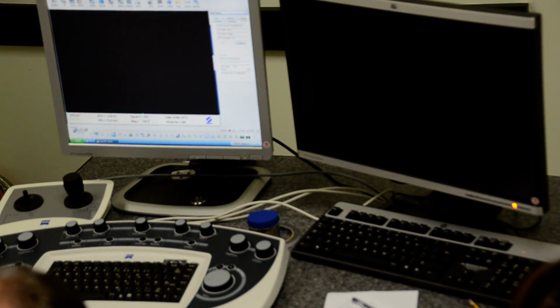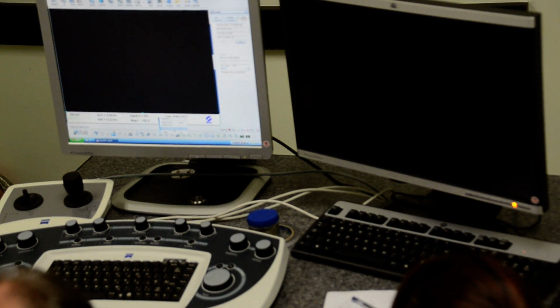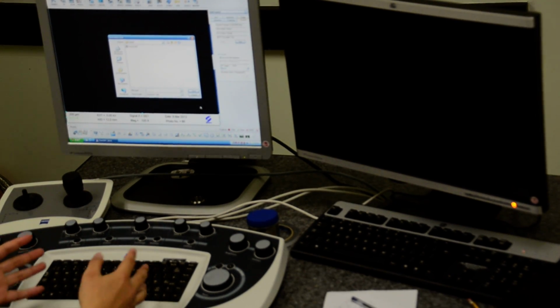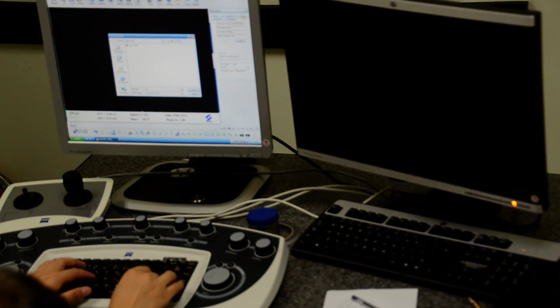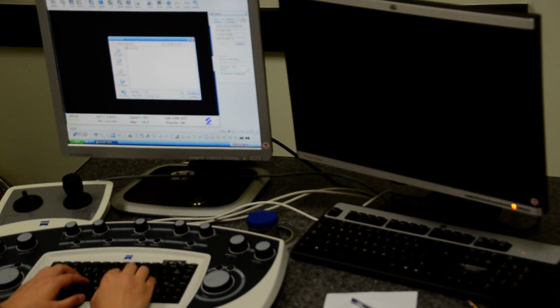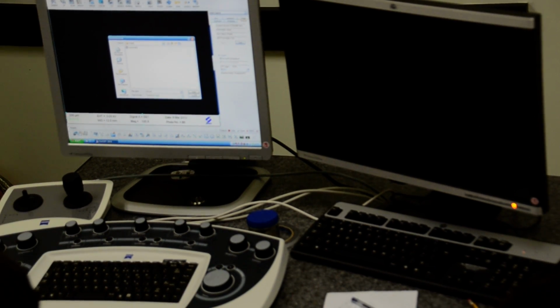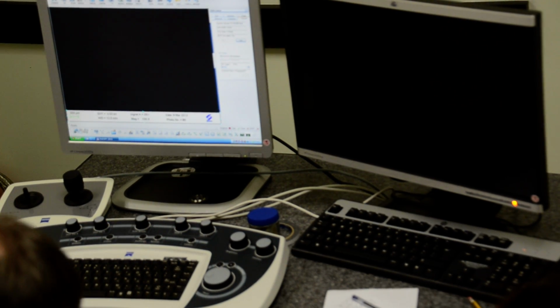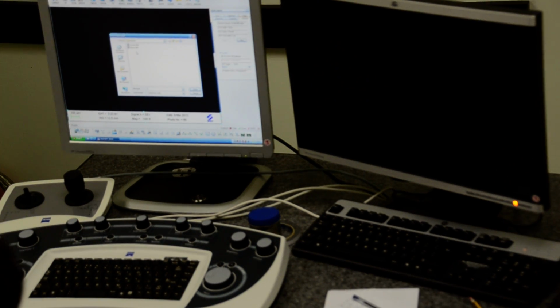So you lock the panel. You see that you have something called data zone. Save as data zone. So you save it. Maybe your, I don't know, your group name. What can I show? Say it's GL OVEO. Okay. It's already saved.